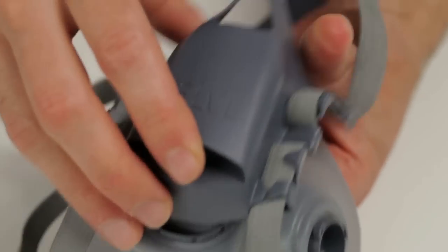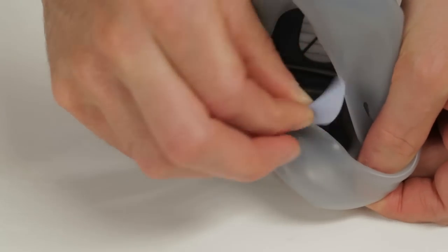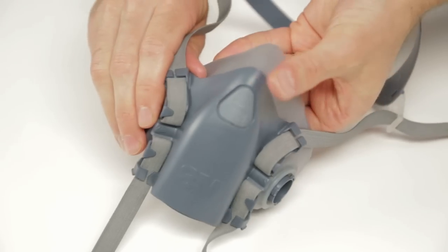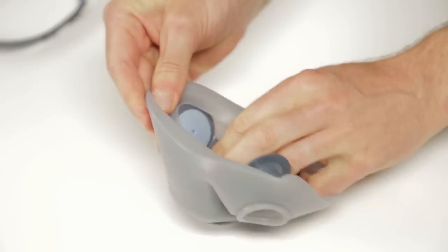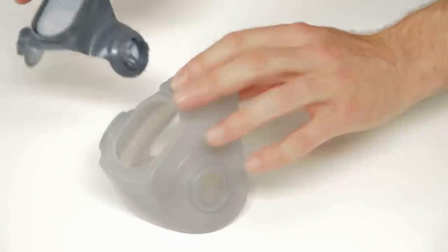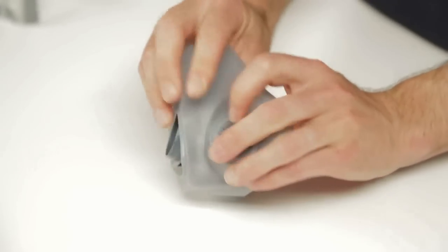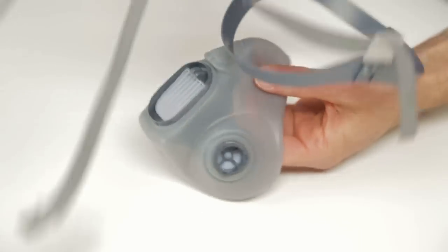Replace the exhalation valve cover as before. To remove an existing inhalation valve, grasp the valve and pull the valve stem out of the valve seat. To replace the inhalation valve, press the valve stem into the hole and manipulate the valve stem from inside the face piece until the valve seats completely. To replace the cartridge filter holder, first remove the head harness assembly as before, then pull the face seal away from the cartridge filter holder. To replace the cartridge filter holder, align the face seal so the bayonet fixtures and exhalation valve housing are fully engaged with the three holes in the face seal. Then replace the head harness assembly as before.